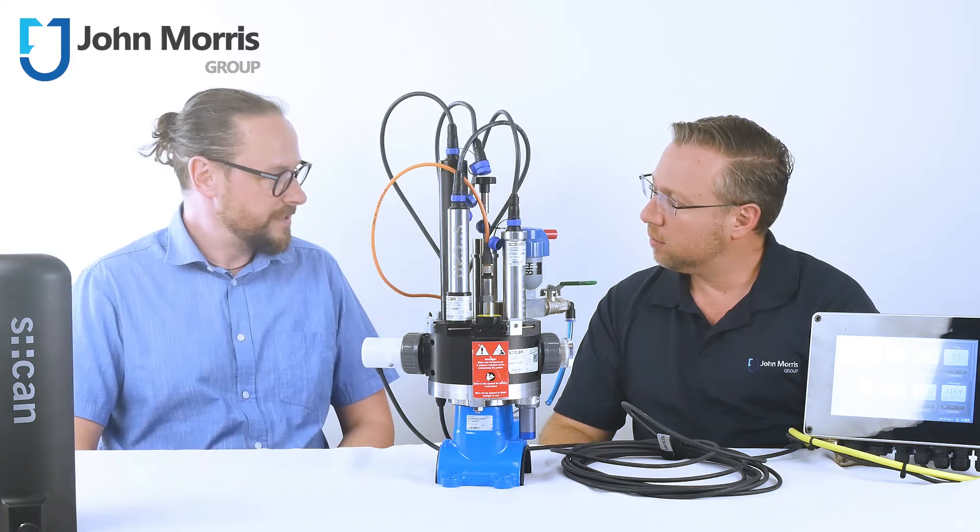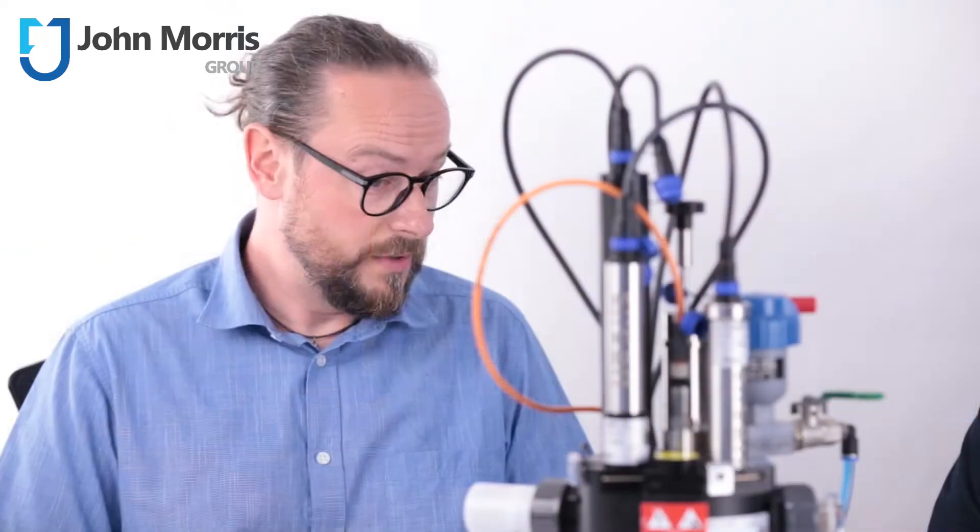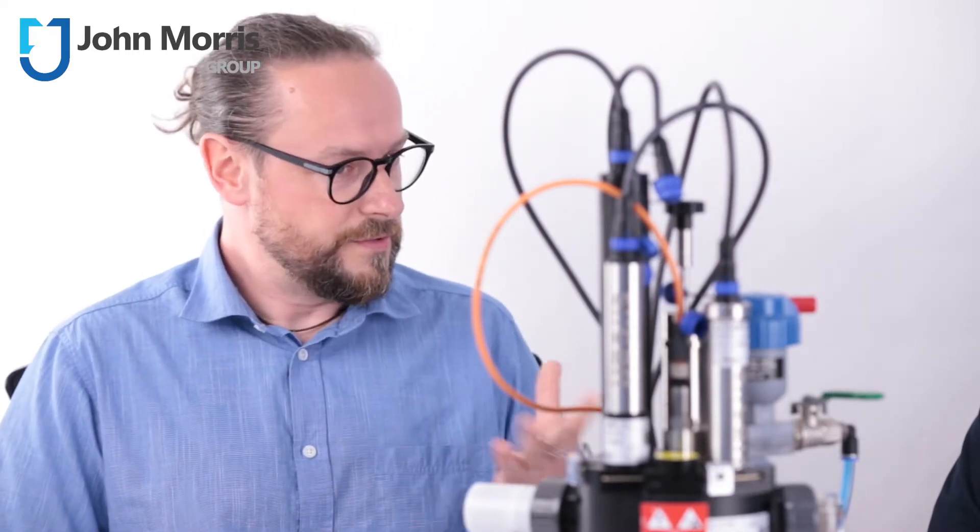So normally the operators have to take samples and bring them to the lab and it takes time. It's cost-effective, time consumable, and so with the PipeScan you have real-time online data. So at the moment you know directly the values of the water.